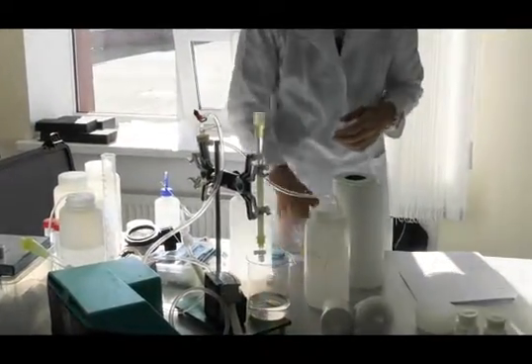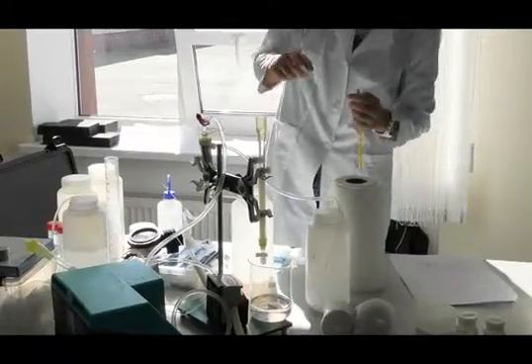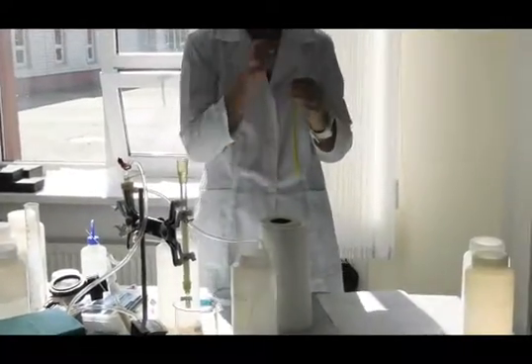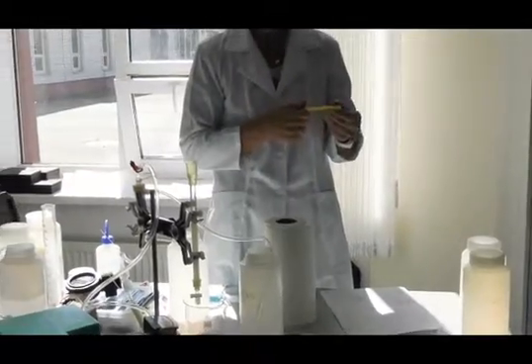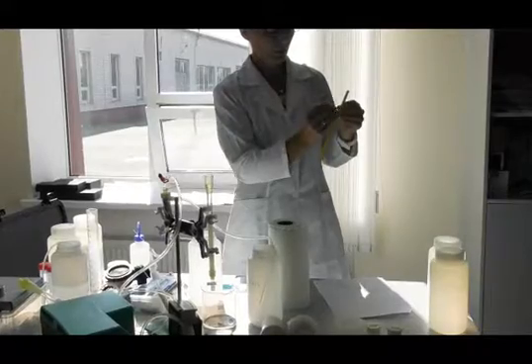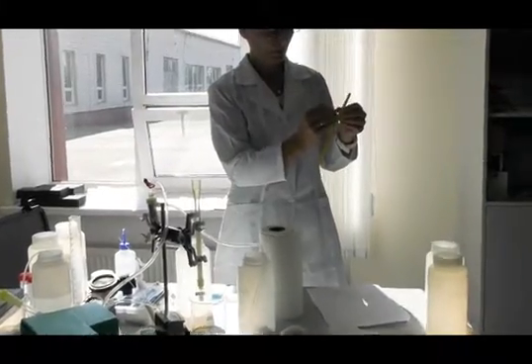The principle of the hollow fiber is that you have these fibers. This is a little bigger, but still it looks like this. And it's a lot of hollows in the walls, like this, all over the tubes.